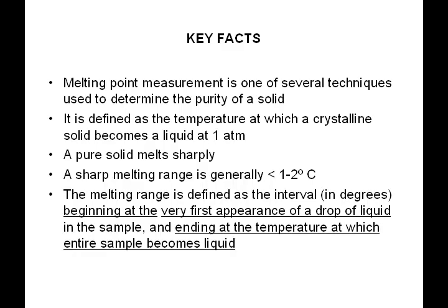Hi everybody, today we're going to talk about melting points. A melting point measurement is one of several techniques that organic chemists can use to determine the purity of a solid. It's the temperature at which a crystalline solid becomes a liquid at 1 atmosphere pressure.